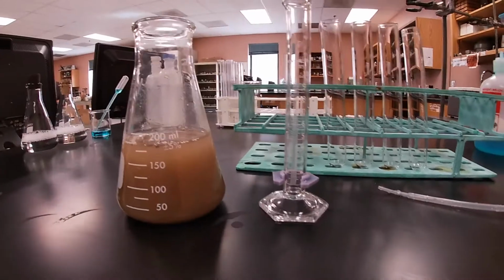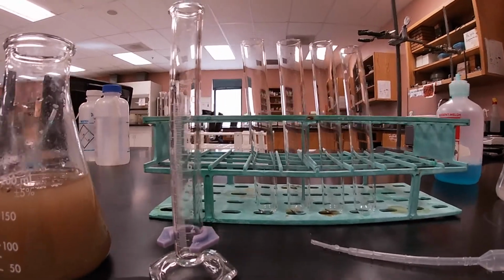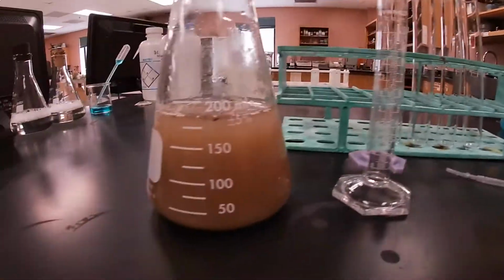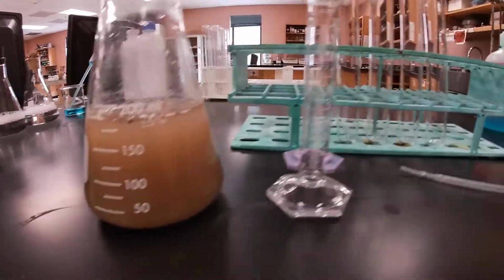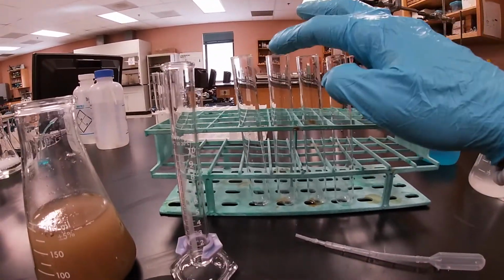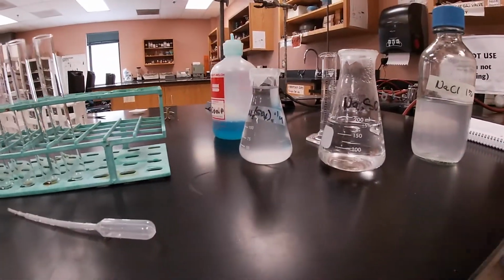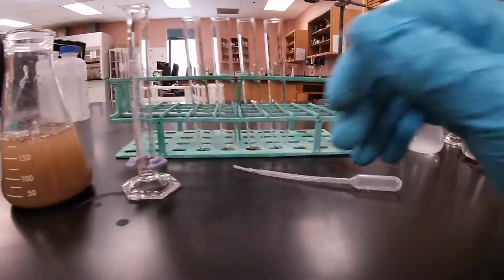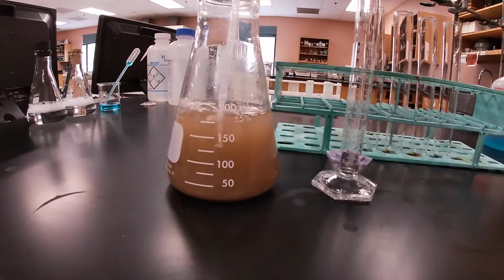Okay, now we're gonna try to purify water. And so what we're gonna do is essentially we have 4 test tubes, and here we have our muddy water, and we're gonna measure out 10 milliliters of the muddy water for each test tube. Yeah, so that means we're gonna put 10 here, 10 here, 10 here, and 10 here. And then we're gonna go ahead and add these solutions to determine which one actually purifies the muddy water better. And so we're gonna go ahead and start, right?